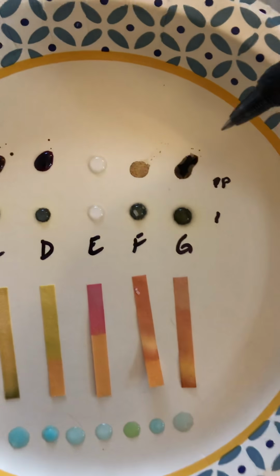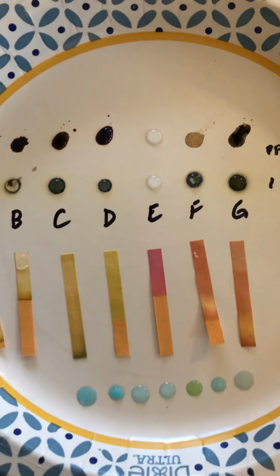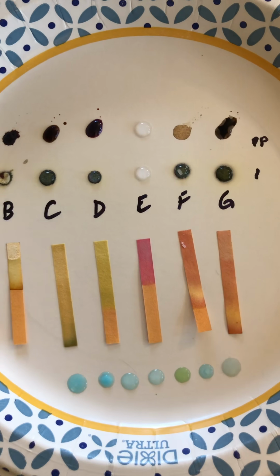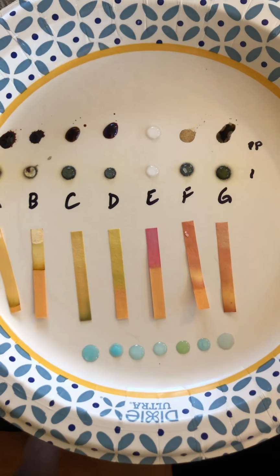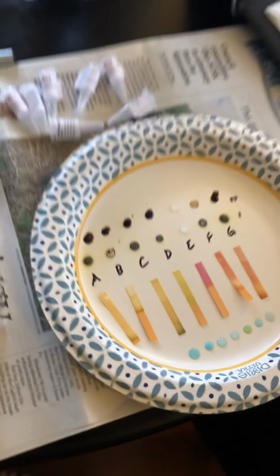I think the tip that I learned in watching the lab video was very helpful, about spreading out your dot a little bit. I had a hard time reading the potassium permanganate dots because they're so dark, so I had to drag a nail through it and get them to spread out just a little bit. And once I did that, it was a lot easier to read. I could tell that this one was a little more brown, this one was a little more purple after spreading it out, so that was a pretty useful tip.